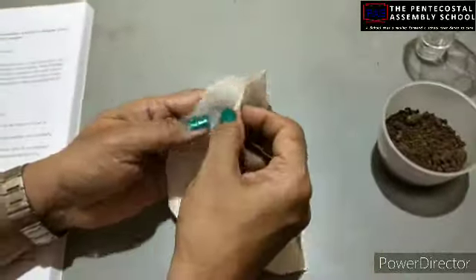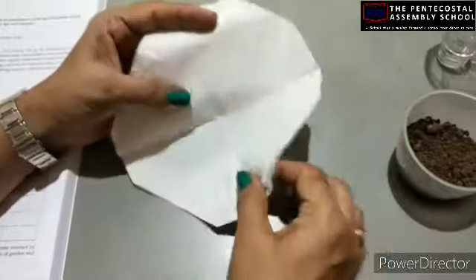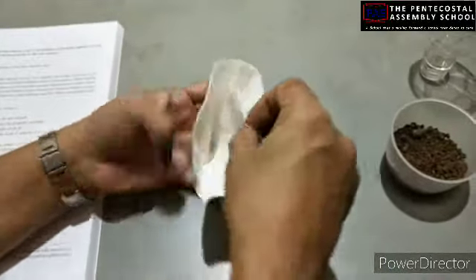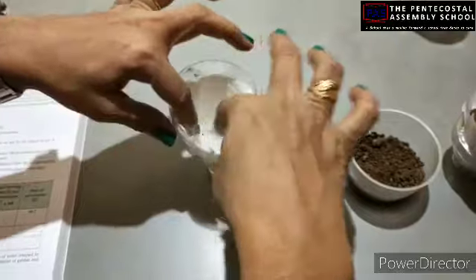Now what we need is to take filter paper. If you don't have filter paper, you can take a napkin and make a circular one like this. You have to fold this and make a cone to keep in the funnel. You can put this cone in the funnel to cover the stem of the funnel.